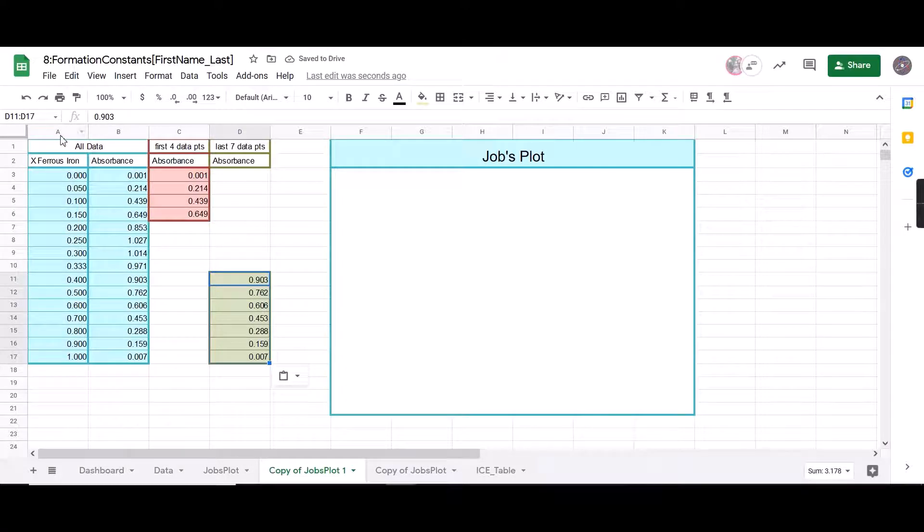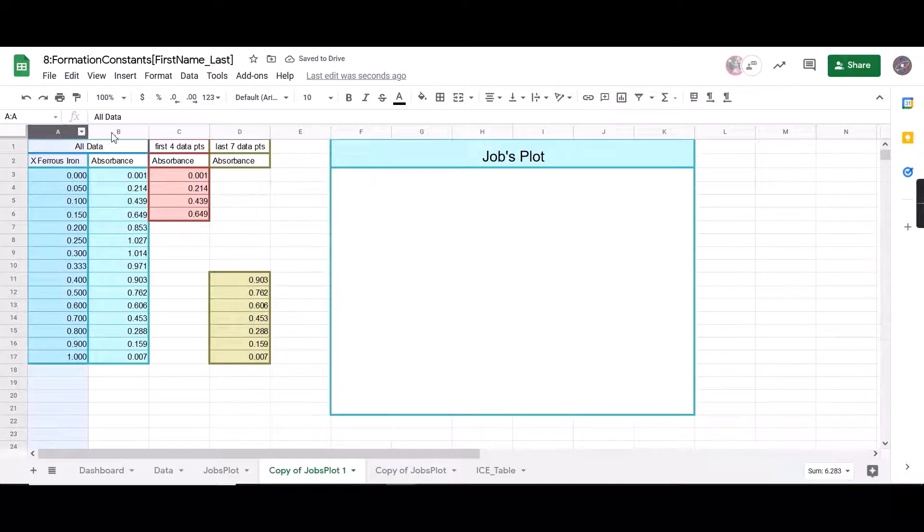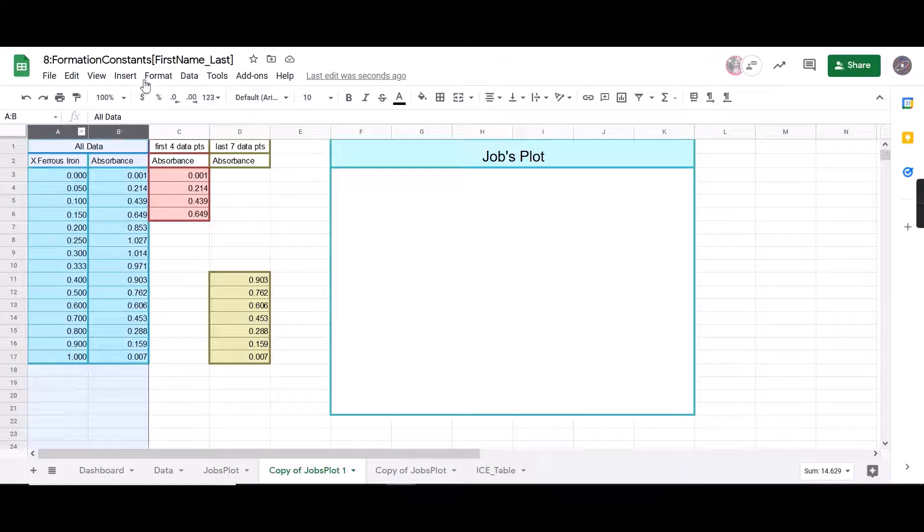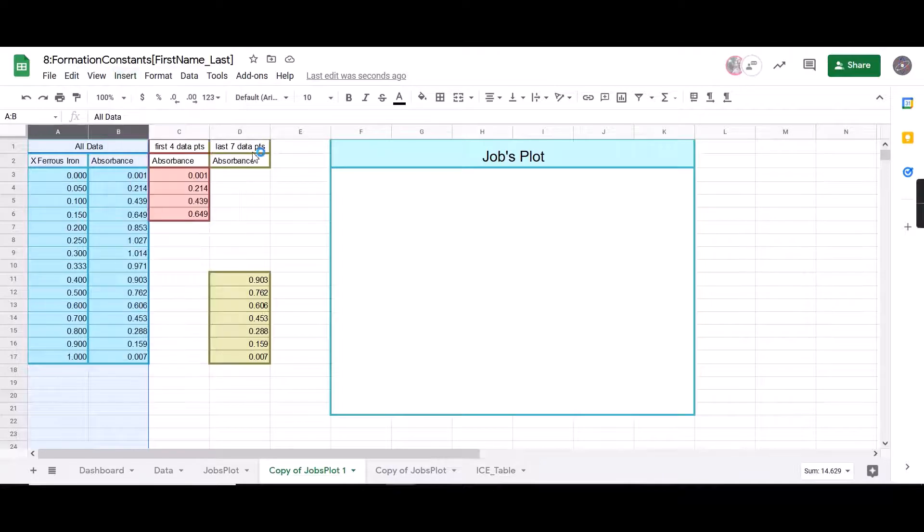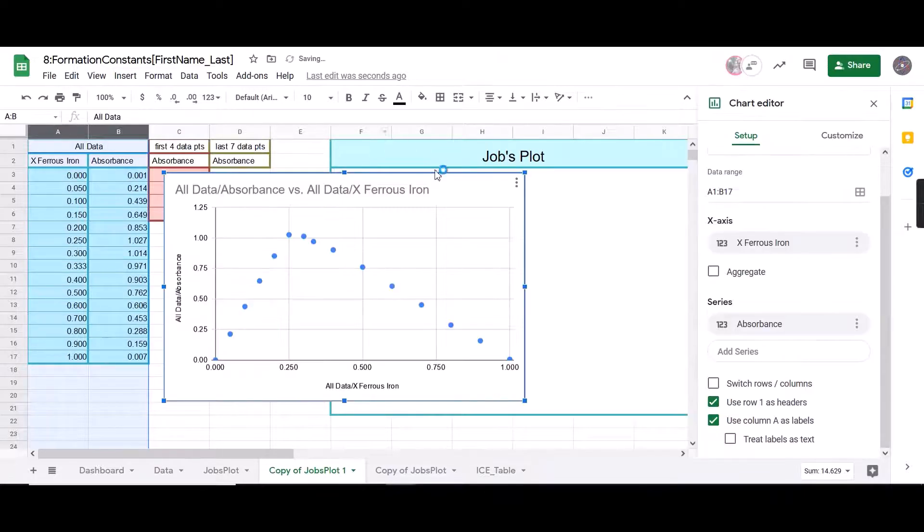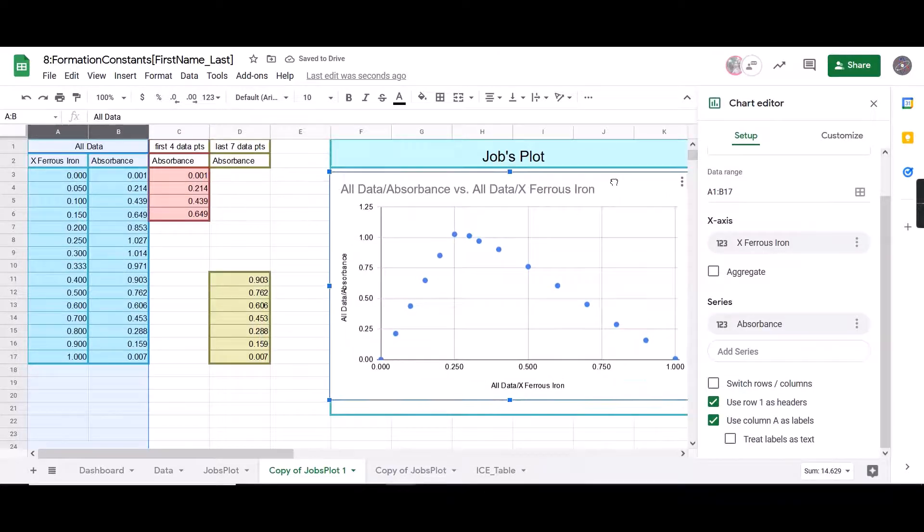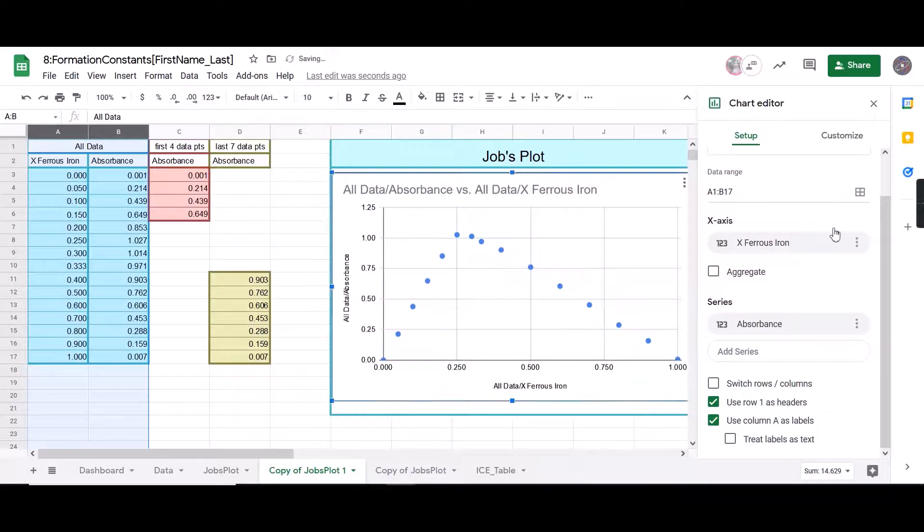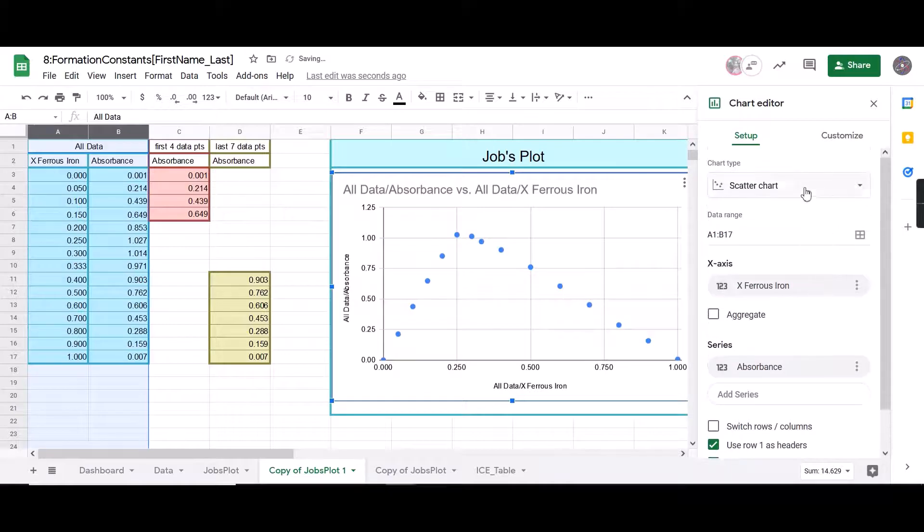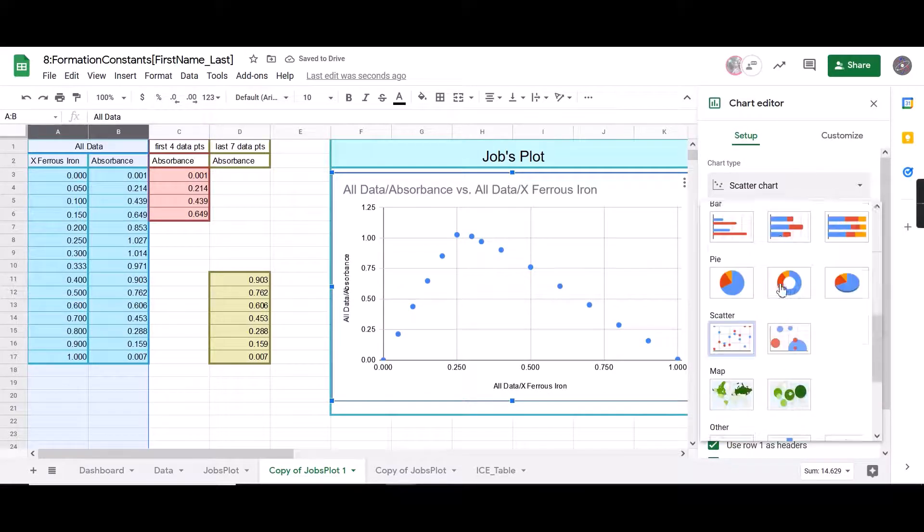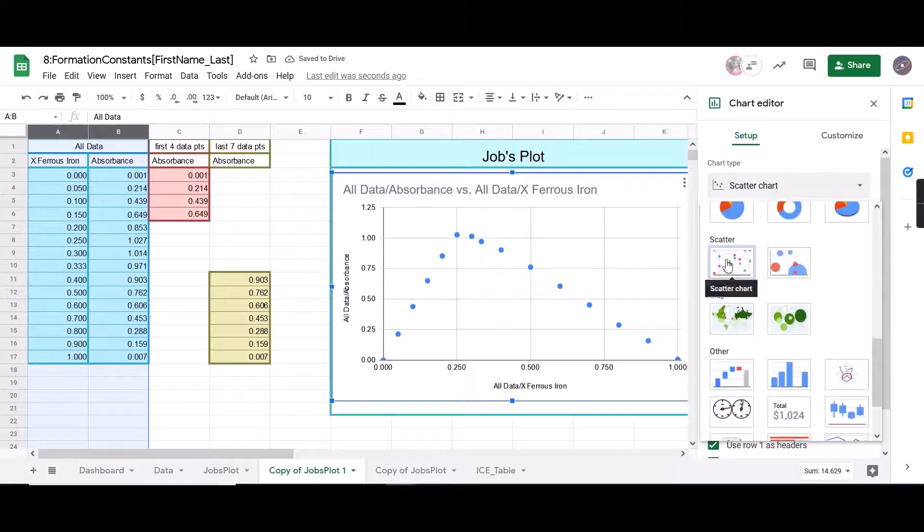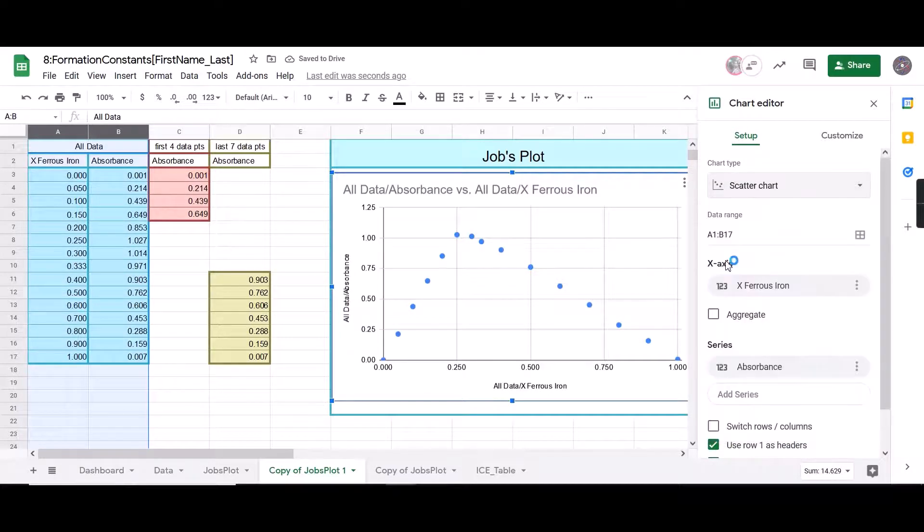Now I'm going to insert my chart. So I'm going to highlight A and B. I'm highlighting the columns, not just the data cells, all of the columns. I'm going to insert a chart. And if Google Sheets is being nice to you, it'll be a scatter plot. If not, you'll have to scroll down and select a scatter chart.